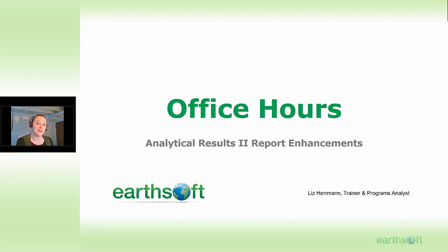There's quite a bit of content that we could talk about with this. I'll do my best to keep it brief. Because of that, I might not be able to talk about every single item that's available in all of the features, but that's all right. Hopefully we'll at least scratch the surface, and you'll get an opportunity to see some of the neat features that are available.